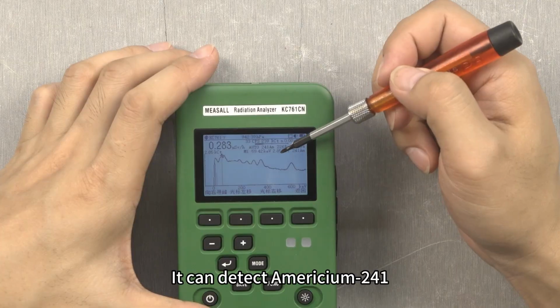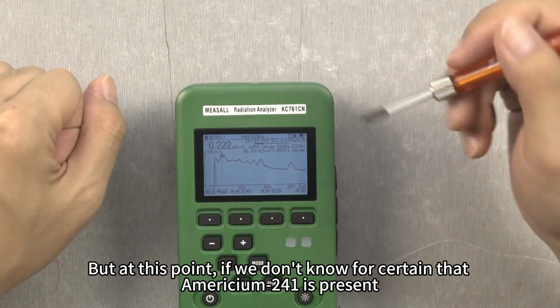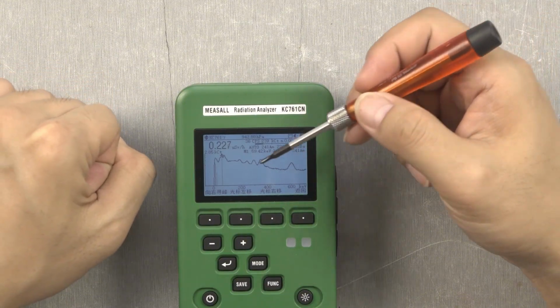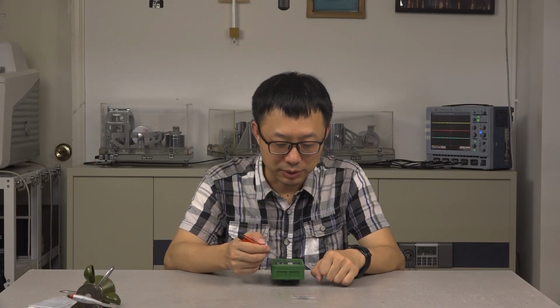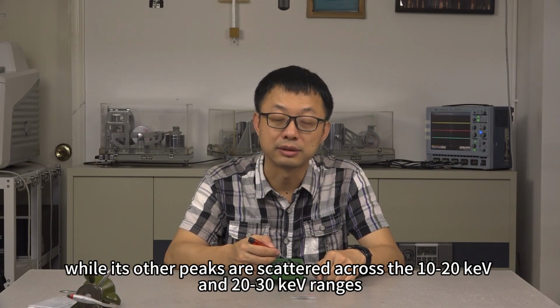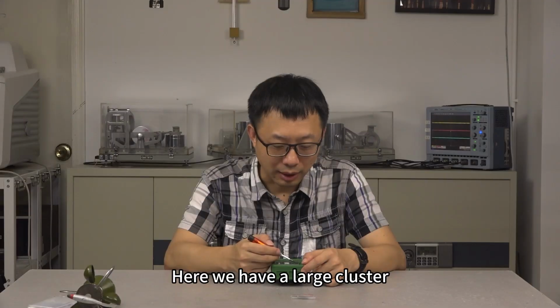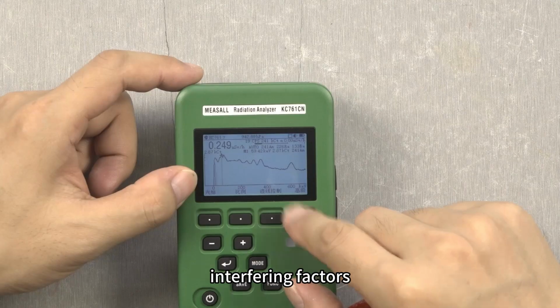It can detect americium-241, but at this point, if we don't know for certain that americium-241 is present, we should still proceed with caution. Because americium has a prominent characteristic peak at 59 keV, while its other peaks are scattered across the 10 to 20 keV and 20 to 30 keV ranges. Here we have a large cluster, and this segment contains numerous other potential interfering factors.